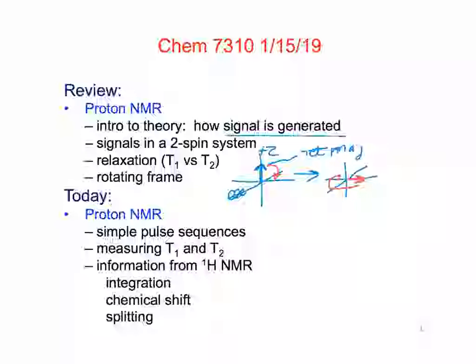If we put our detector over here, or we could even just listen to this. Sometimes I put here's our ear. What we'll hear is the sound will change as the direction of that vector changes. So as it comes close to you, it would get louder. As it goes away, it gets quieter.